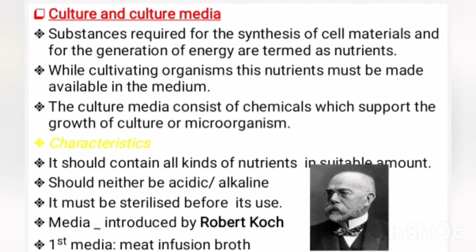There are certain characteristics for the culture media. It should neither be acidic nor alkaline. It should contain all kinds of nutrients in suitable amount, and it must be sterilized before its use. Sterilization means free from microorganisms.